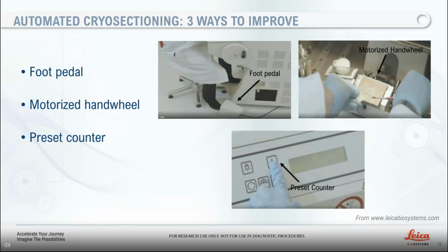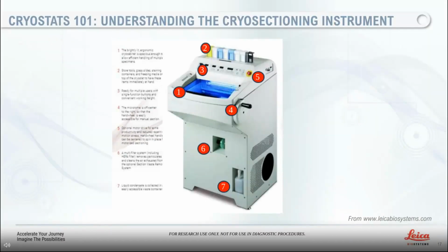Automation means using mechanization instead of a manual or hands-on process. In cryosectioning, automation can consistently strive towards removing variability and improving consistency in cutting and trimming of your specimen. For example, on a manual cryostat, the user sets the parameters and manually cuts, one by one, each section while collecting them on a slide.